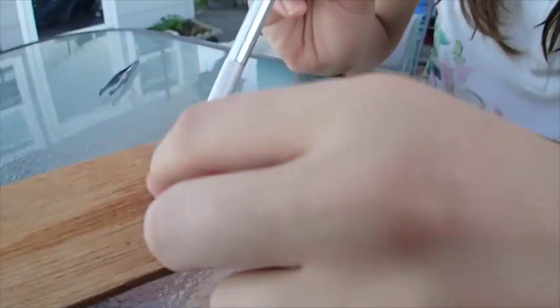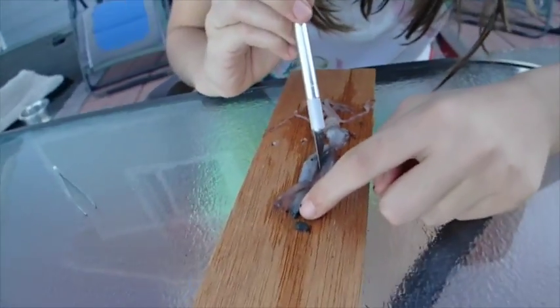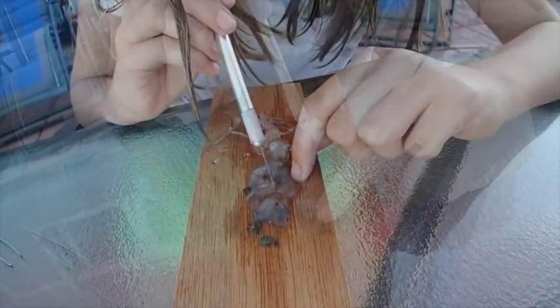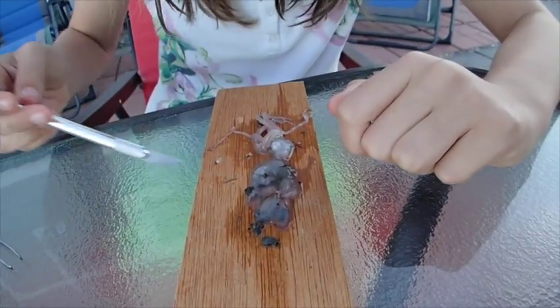Okay, now we're going to cut it open. That — the ink sack — this is all the ink sack right here. It's very gross.